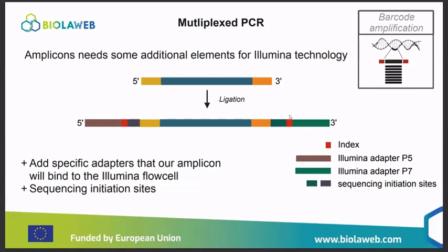This can be increased indeed if you have questions, and particularly if you are interested in rare and not abundant species in your sample. You choose the sequencing depth, and in some cases you can ask for a given amount of sequence per sample, and that could be interesting for rare species. Okay, thank you.